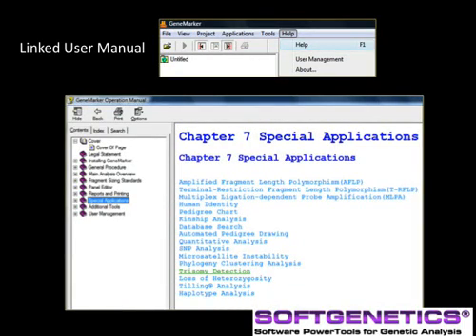Today we used a demonstration data set to review the features of trisomy analysis with GeneMarker. For additional details and immediate assistance, GeneMarker contains a linked user manual. Chapter 7, Special Applications, has a complete section for trisomy detection.